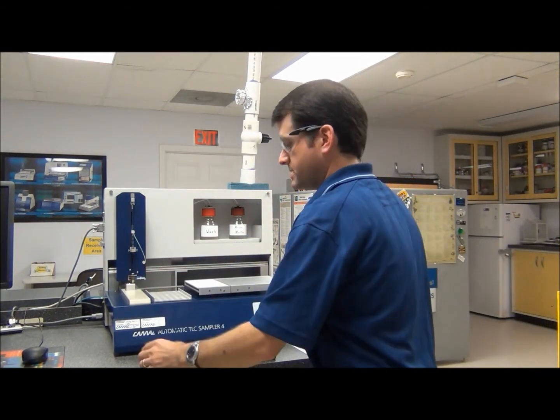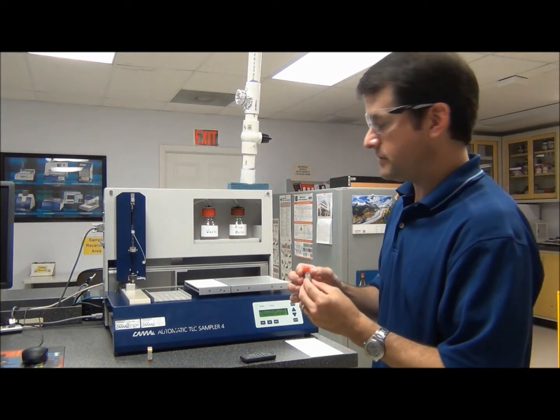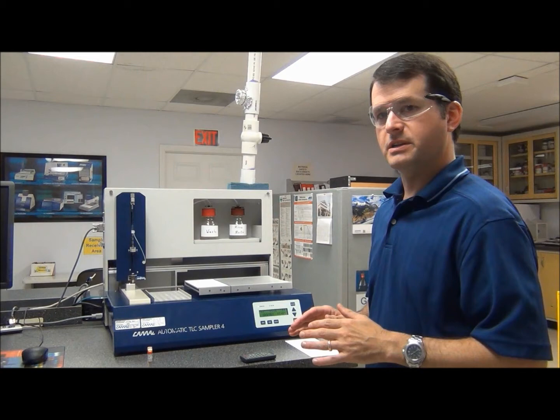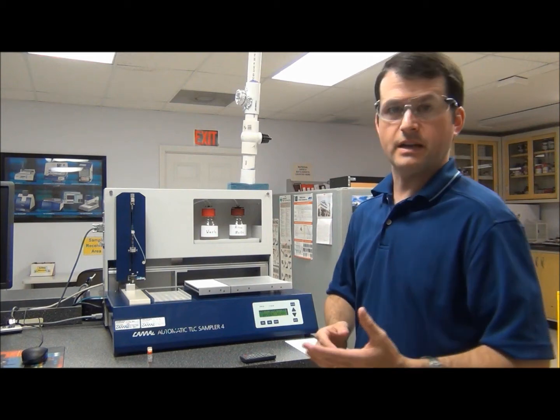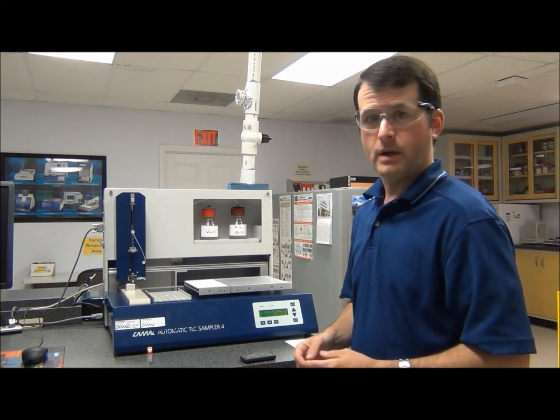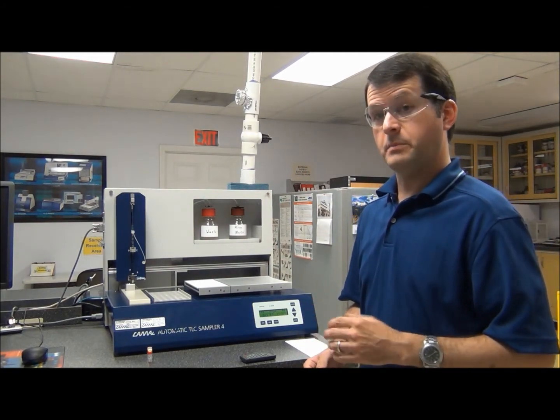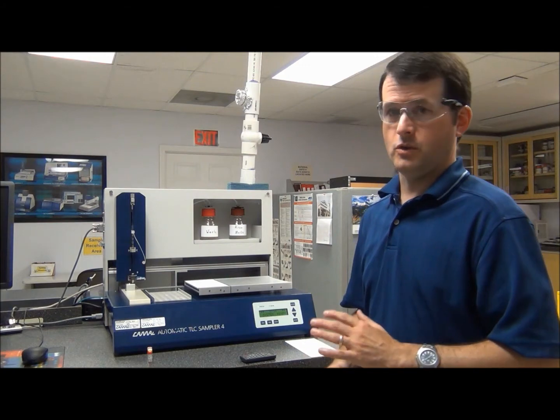For the vials themselves, these are just standard HPLC type vials — nothing complicated, just basic vials. The samples are going to be sprayed onto the plate via a gas — we have nitrogen hooked up to this, though you can use very clean air or nitrogen. It will spray the sample down on the plate in band form, which is the preferred way to apply sample using HP TLC. This instrument will also allow you to put down your samples as spots or contact transfer, but for our purposes, doing HP TLC, you want to do it as a band — the spray-on band.